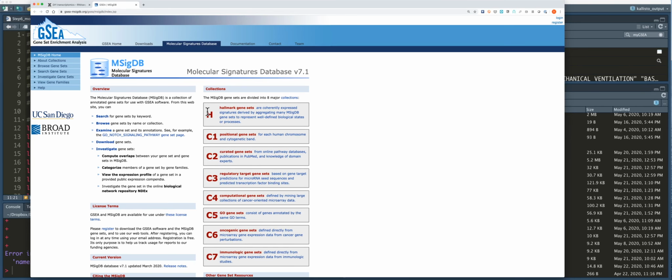sum statistic. And so this common graphical representation of a GSEA result really has taken our ranked list of genes and tipped it onto its side. That's the colored bar here, with genes that were at the top over here, now on the left, and genes that were at the bottom on the right. And anytime one of the genes from the signature, in this case this was evaluating a single signature, and it doesn't matter which one, a vertical line was struck anytime they saw a gene. So what you can see is whatever signature this was, there were a whole lot of genes found at the top of the list, suggesting a strong enrichment in our treated group or disease group, whatever you want to call it. How does that running sum statistic really work?